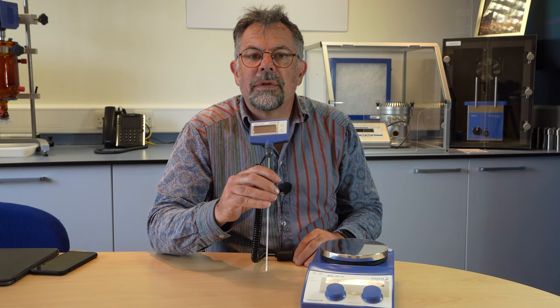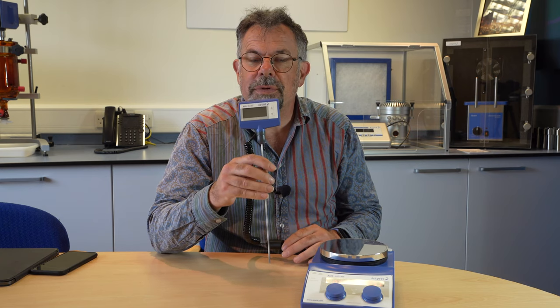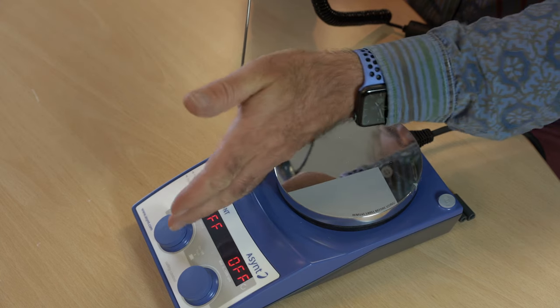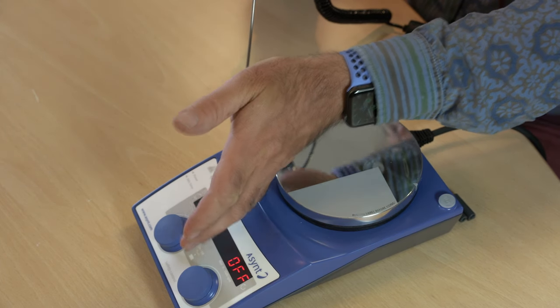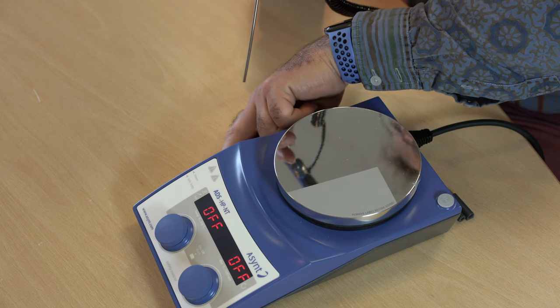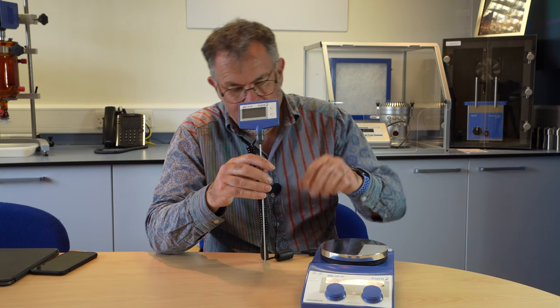When you buy this hot plate stirrer package, it also comes with a digital temperature controller to give half-degree accuracy. This is yet another independent temperature circuit — so we have the front knob, the side screwdriver adjustment, and this digital controller: three independent circuits.